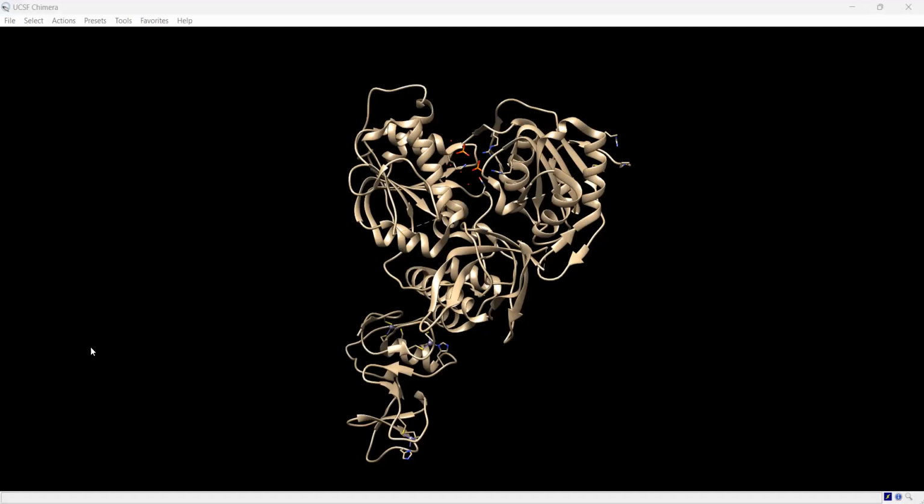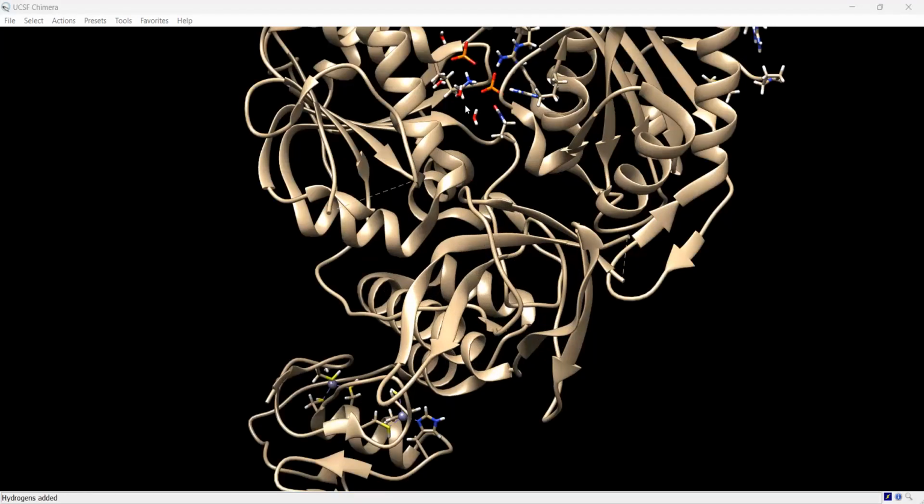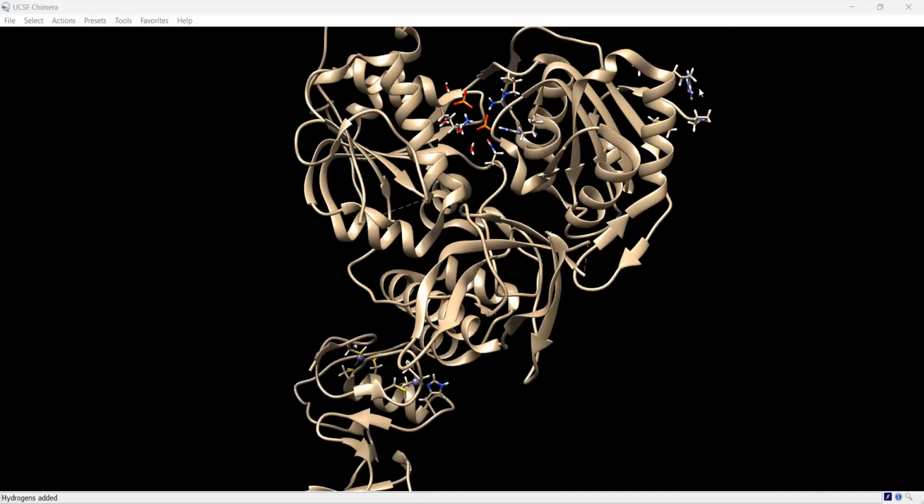Add hydrogens, we can have steric only or hydrogen bonding. In this instance, we're going to include the hydrogen bonding because that's important to the structure of the protein. And we're going to keep the protonation states at histidine. Okay. Just press OK, and it'll run those calculations. So now you can see it's added the hydrogens to any residues, and it's factored in the hydrogen bonding there.